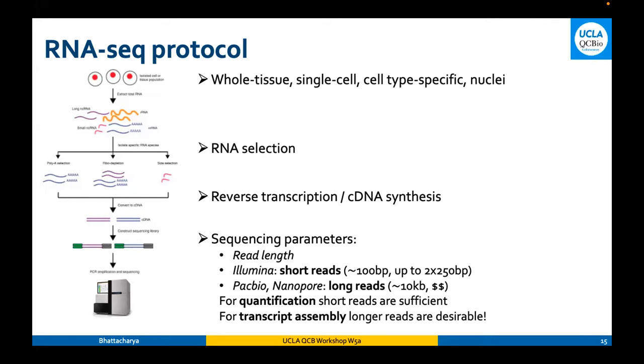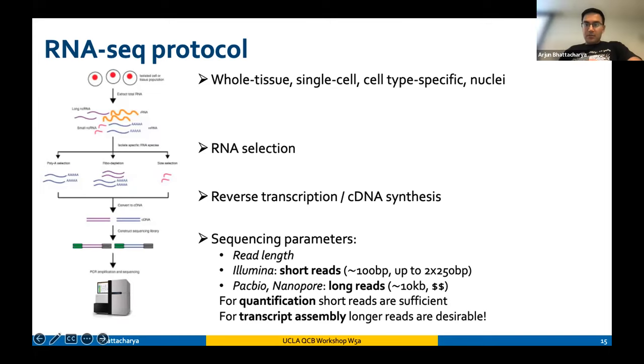So, Arjun? Yes. May I ask some questions? Yeah, of course. I'm curious, is there any way to select specific RNA before the DNA synthesis? Or how do we isolate unwanted RNAs? Is it before all of this analysis, or after cDNA synthesis and the reading process?